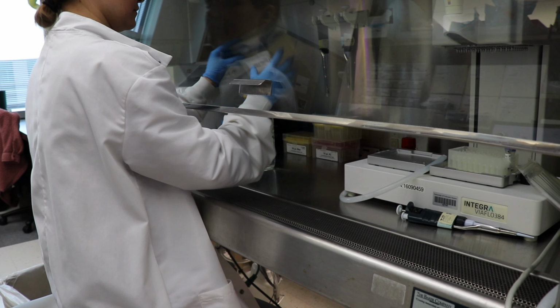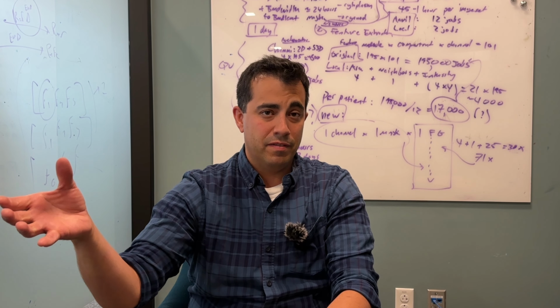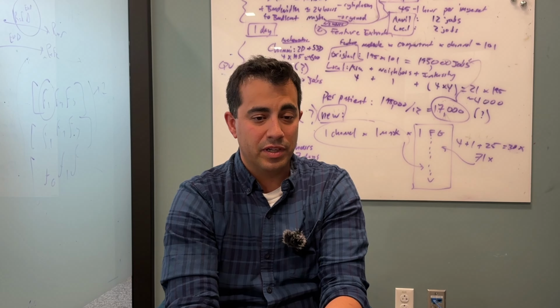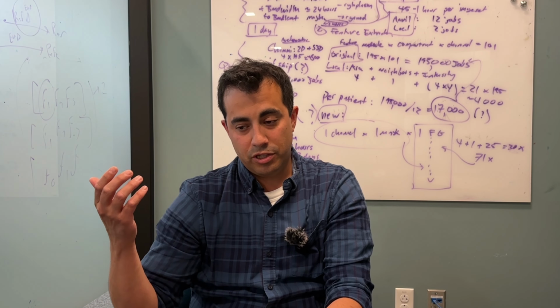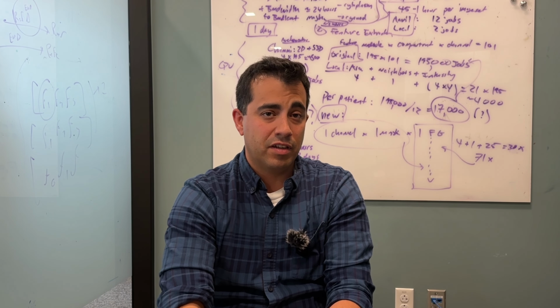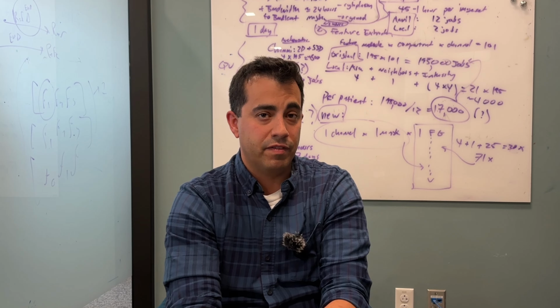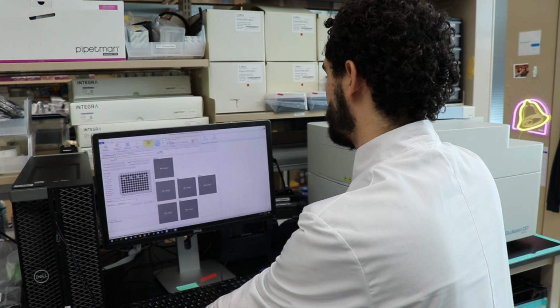So Cytomining performs the image-based profiling pipeline. What it's going to do is take in features that we've already extracted from microscopy images and process them through an image-based profiling pipeline. That means it's going to annotate the single cell, so it's going to tell me which treatment the cell came from, which well. It's going to normalize the single cells, so it's going to make sure that all the features are on the same scale. And it's going to perform feature selection, which is just to make sure that all the features are informative in the profile that we then analyze downstream.